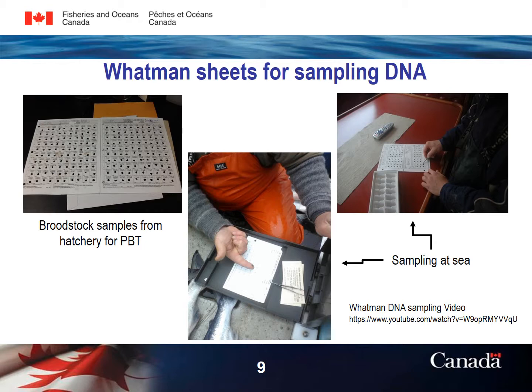Working under cover is preferred. This sampler has found an ice tray to be a handy way to move a tissue punch from the back deck to work inside.